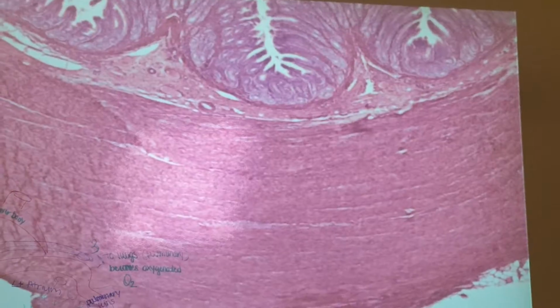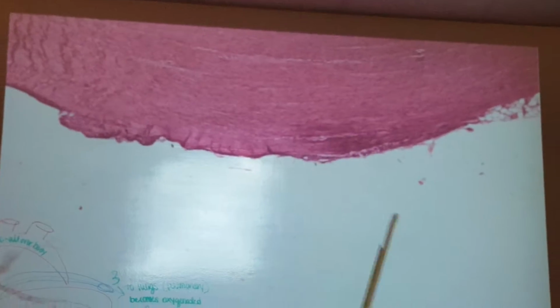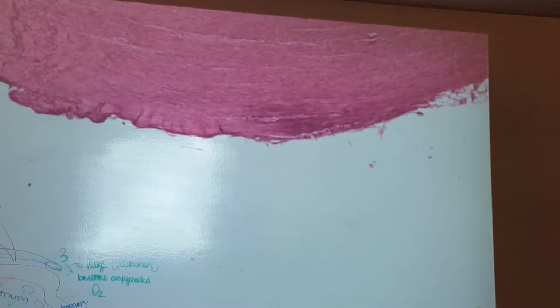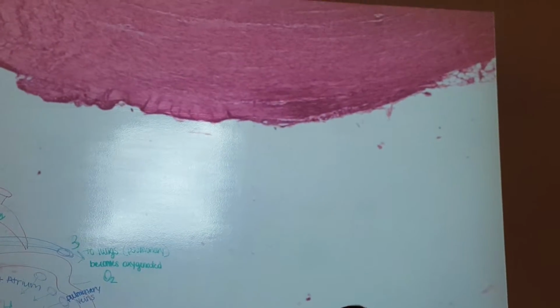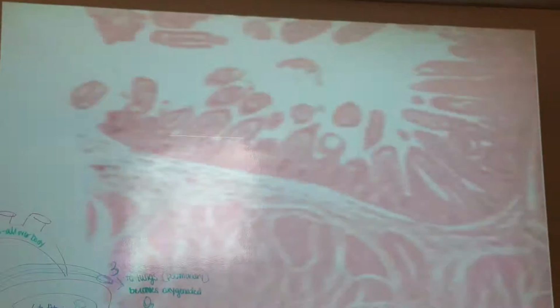Yeah, I really wouldn't worry about the different cuts of the muscular section. Just recognize serosal layer here. And we still haven't seen the lymph nodules? I've not seen a lymph nodule yet. Everything else is the same on the ileum.